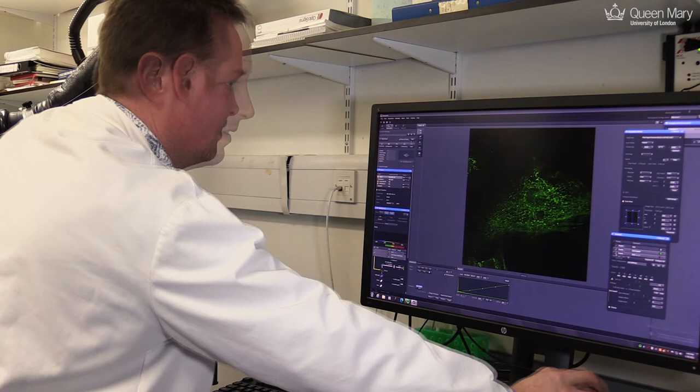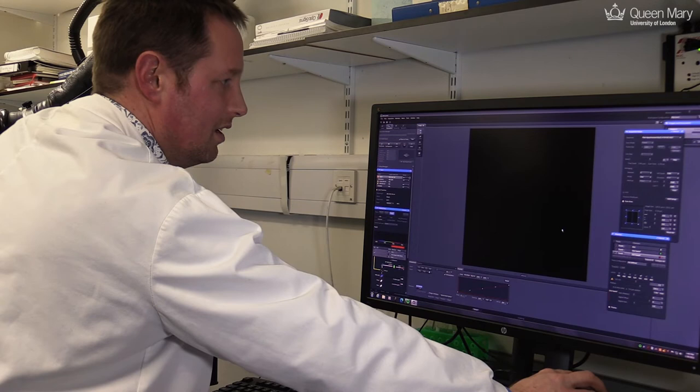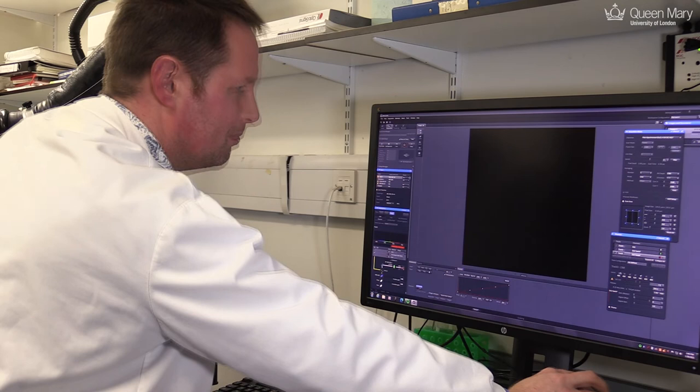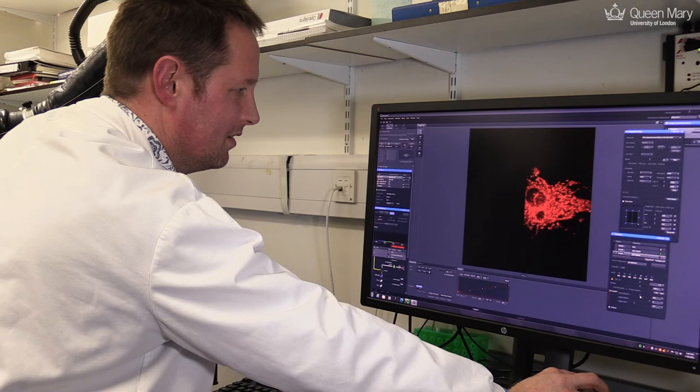And we can then do the same for the mitochondria, which are stained with a red dye. So when I start scanning, you should see the mitochondria come up as red dots. There they come.